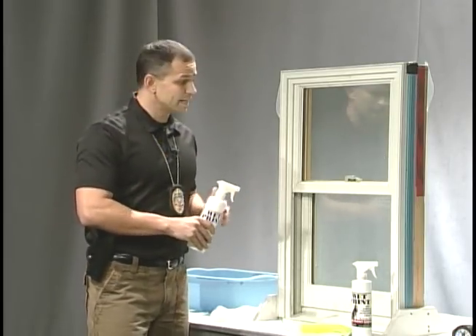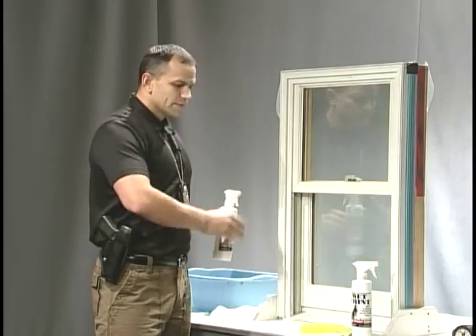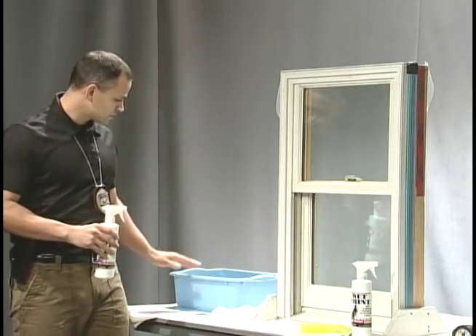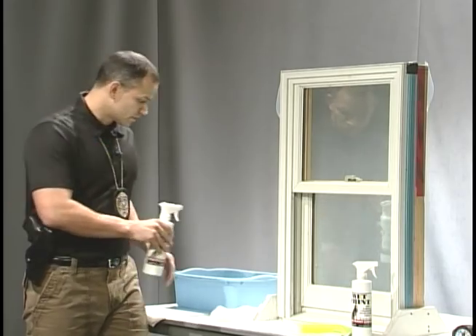So what I have set up today is a window that may have some fingerprints on it. We're going to use our WetPrint to try to develop the prints, then we're going to use our tape to lift the prints. I also have set up some cups that have been submerged in water, and we're going to try to develop them with the WetPrint as well. So let's get started.